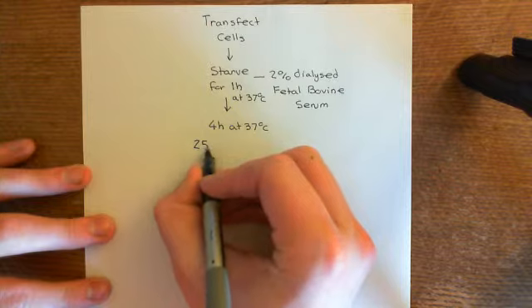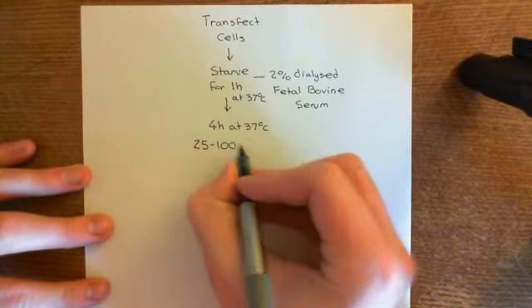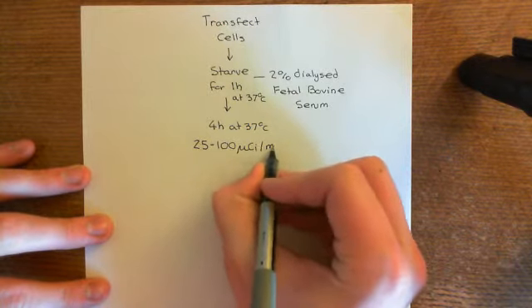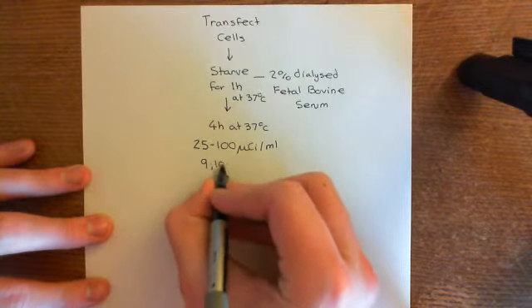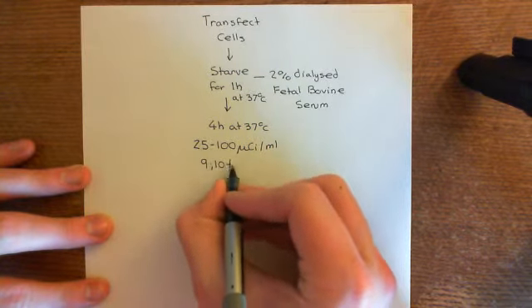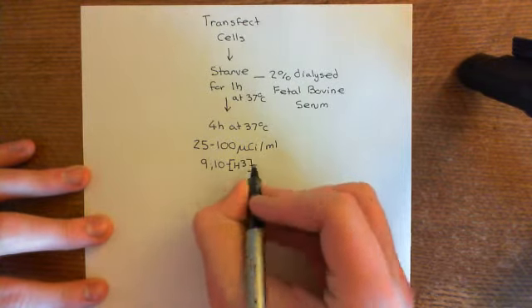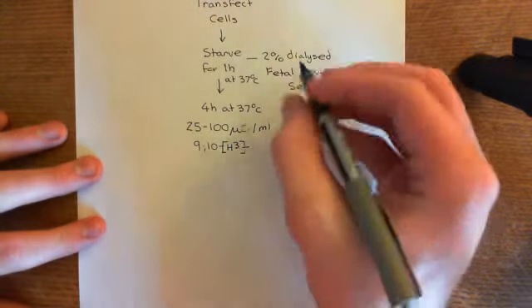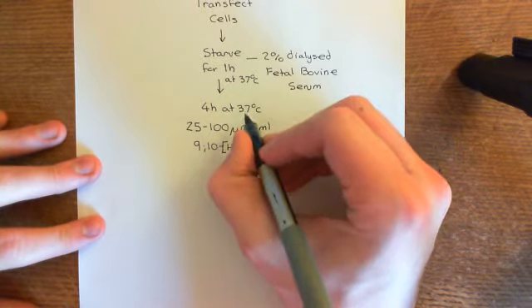which results in you having a concentration of radiation of 25 to 100 microcuries per milliliter, basically. And this is going to be 9,10-tritiated palmitic acid. So let me explain what this means. Basically, you are going to have a certain concentration of palmitic acid in the solution that you will be adding on to your cells and exposing them to for 4 hours.